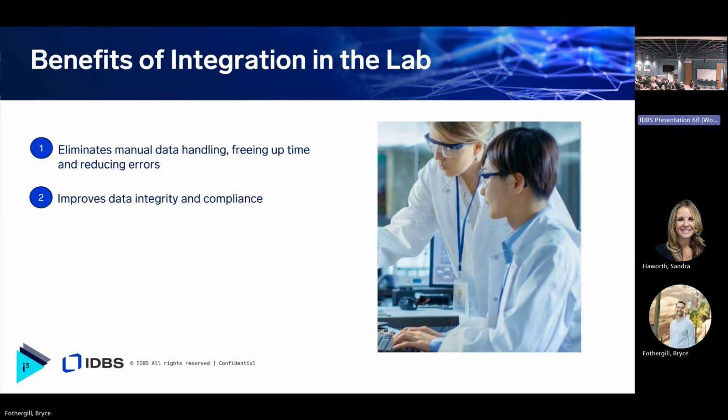Again, since you're removing that middle layer, you don't have to worry about the integrity piece. It's all done for you via the OPC connector integration, and it is nicely structured as well. You don't have to worry about all the transforming that no one wants to do. I want to do it because I'm a data scientist, but you don't have to. Next, it unlocks real-time access across teams. You don't want to spend your time doing this. We're freeing up that time for you to do more important aspects of your job.